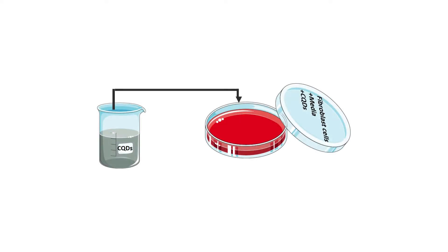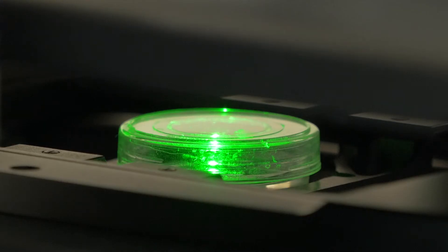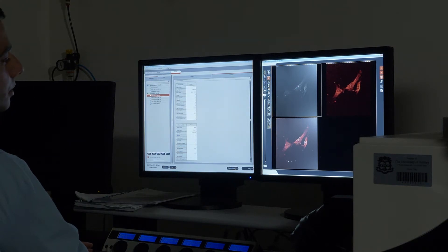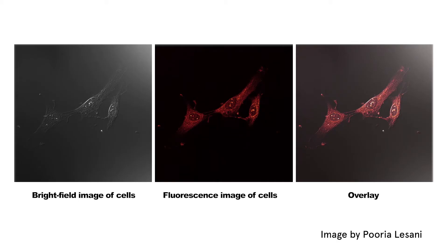Next, we add the carbon quantum dots to the cells' media and the cells will uptake them. I have put the new prepared dish on the microscope and adjusted the objective and laser on the sample. Wow, that's amazing! Now you can see the strong fluorescence of the cells after incubation with carbon quantum dots, which makes us able to see the details of the cells.